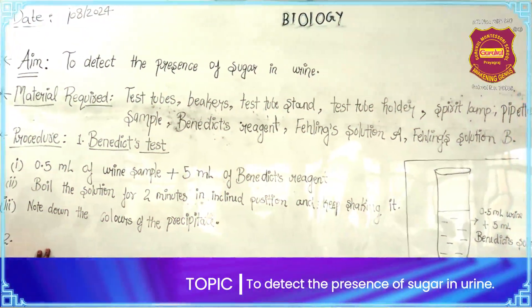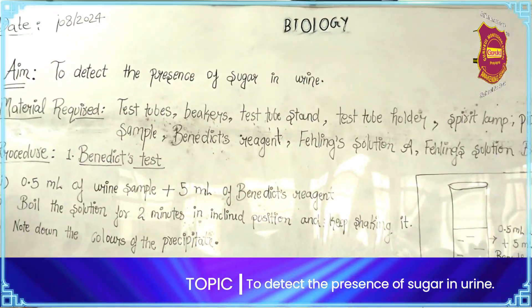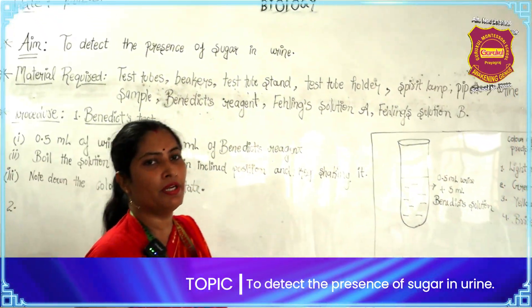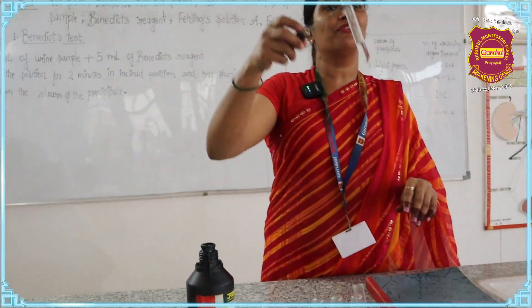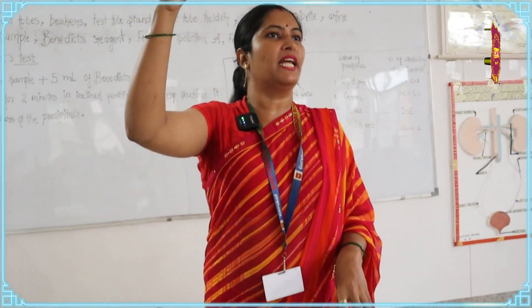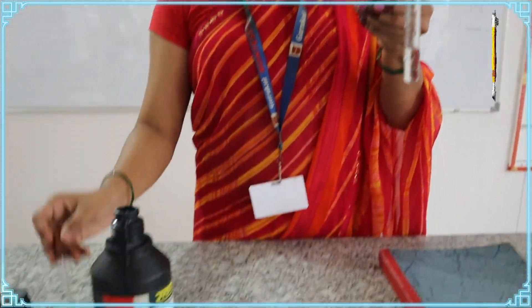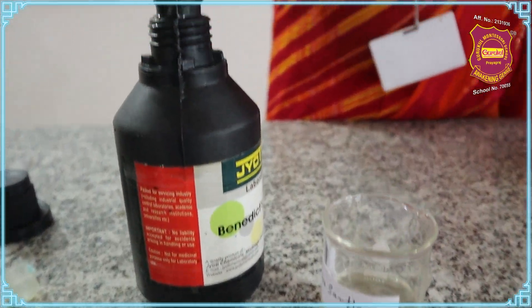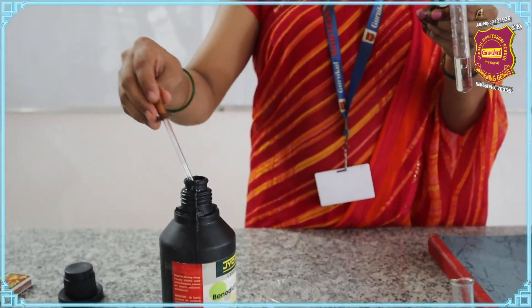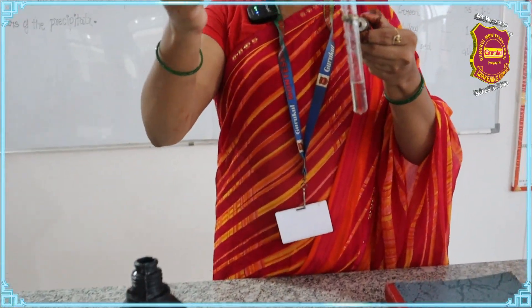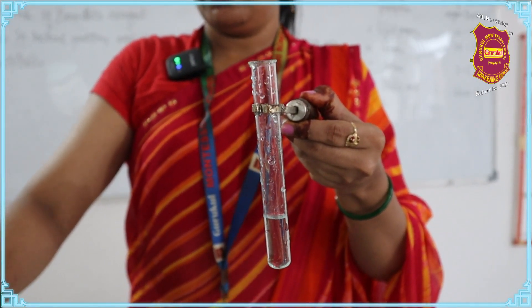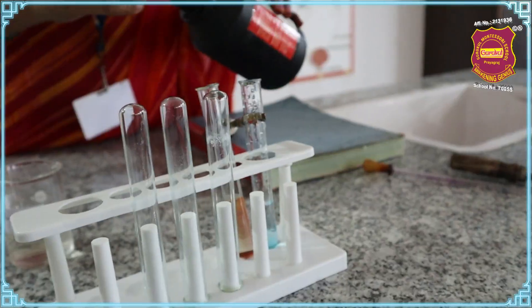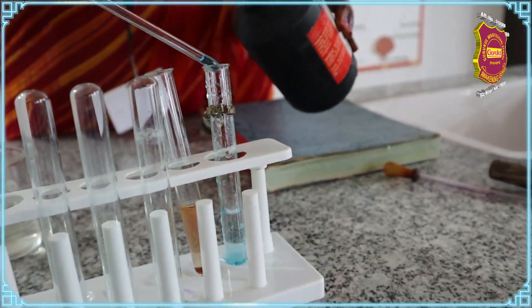We are testing for the presence of sugar in the urine sample. The urine sample is given on your table. Take 5 ml of the sample in the test tube, and afterwards add at least 2 ml of Benedict's solution over it with the help of this dropper.